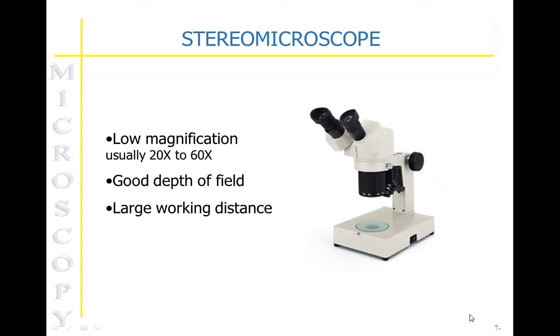Most stereo microscopes also have a very large working distance, which allows the analyst to look at a lot larger samples. Initially, this is used for a lot of initial examinations to actually find small pieces of evidence, to collect pieces of evidence off of items, or there are some instances where the stereo microscope is the actual analysis tool. In firearms sections, there might be projectile or cartridge casing comparisons that are done on a stereo microscope, or tool mark comparisons are also done on a stereo microscope.